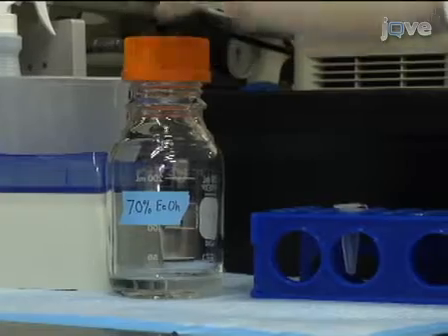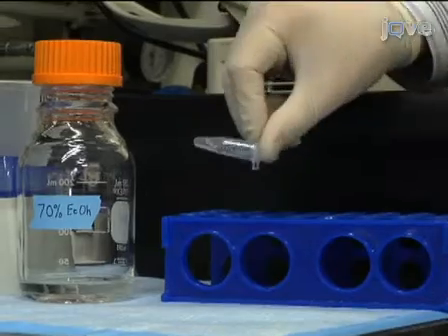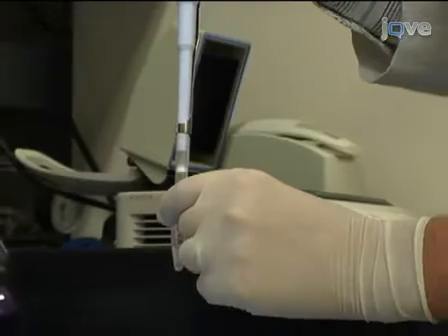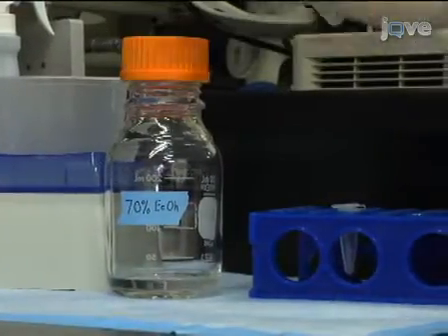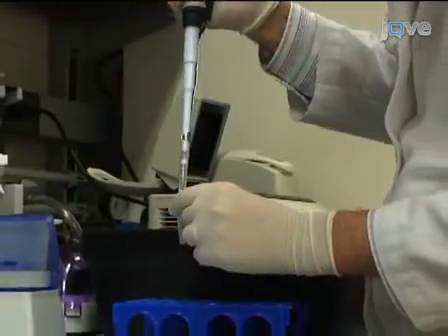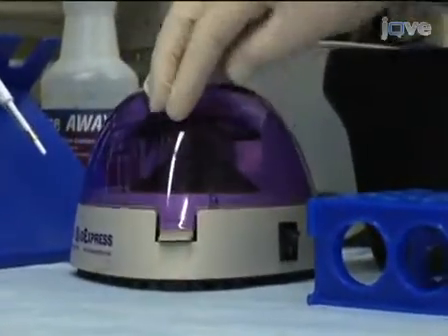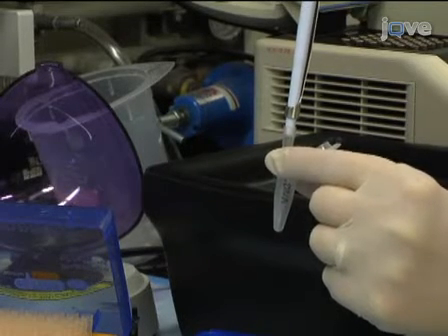Wash the pellet by adding 500 microliters of 70% ethanol and mix by inversion. Centrifuge the sample at 12,000 g for 5 minutes. After centrifugation, remove the supernatant with a pipette. Repeat the wash: add ethanol, centrifuge, and remove the supernatant. After the second wash, briefly spin down the tube to gather any remaining liquid. Remove any excess liquid and allow the pellet to dry at room temperature for 5 minutes.